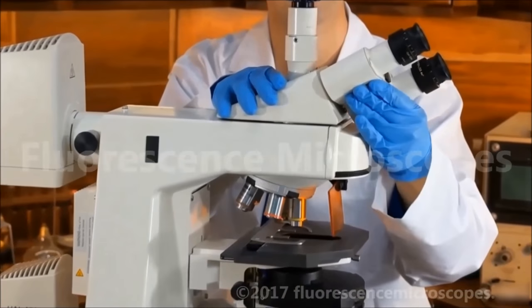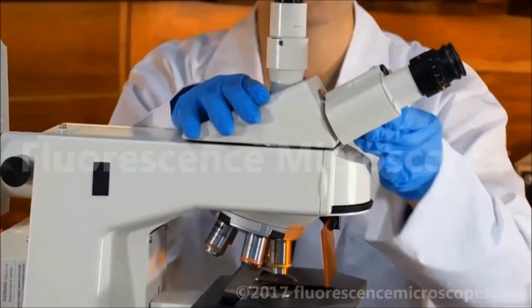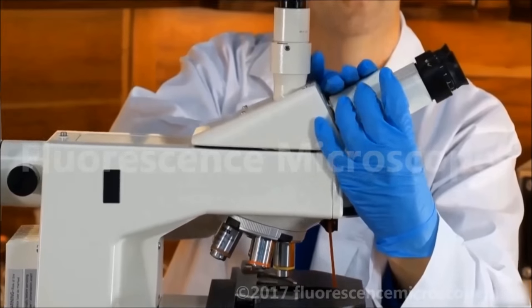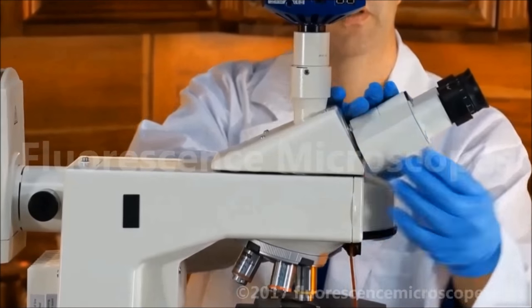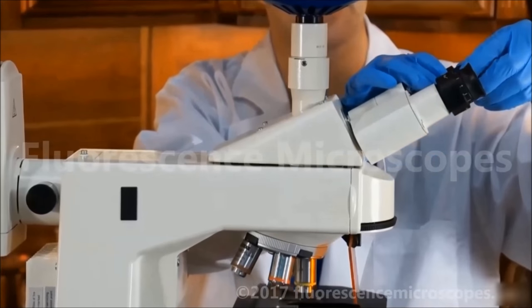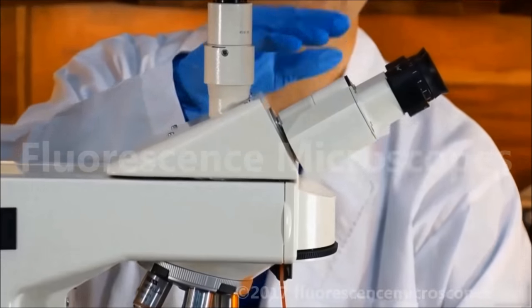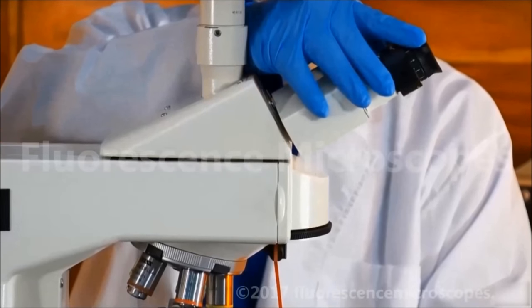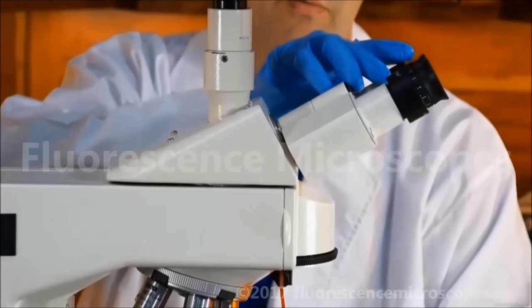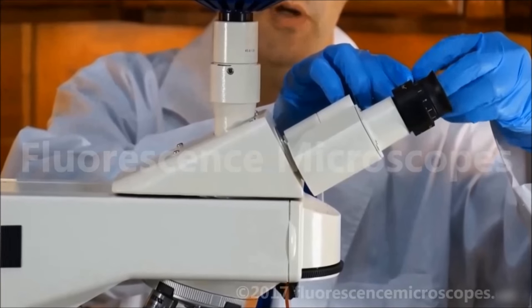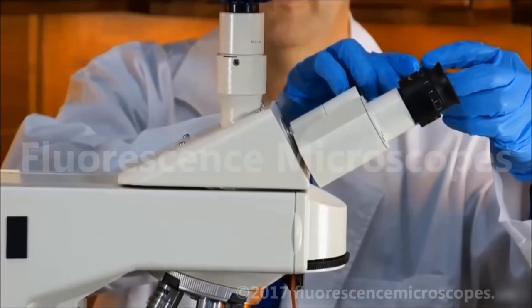The head can rotate. You can set your interpupillary distance. You have diopters on both eyepieces. That's to get in focus. If you focus everything on this eye, then you can change this diopter so your other eye has everything in focus.